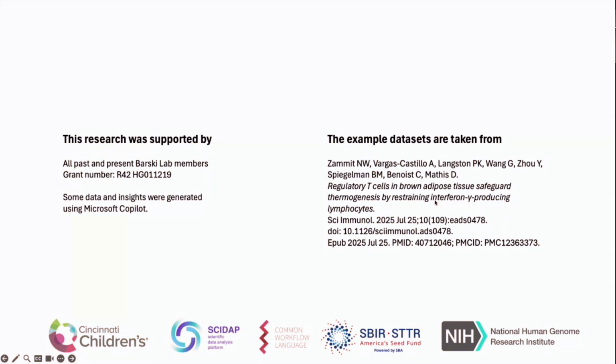I've seen some cases where it will look very good after you've removed that batch effect. From a heat map perspective, everything looks nice and consistent. But if you take it back to the original normalized data, you'll get these streaks where it'll be a single sample that has driven that gene being called as significant. So do you ever do that, or how do you think you could approach something like that?